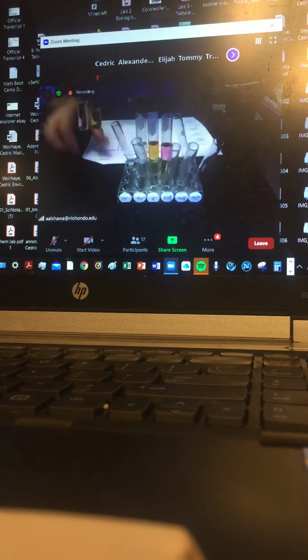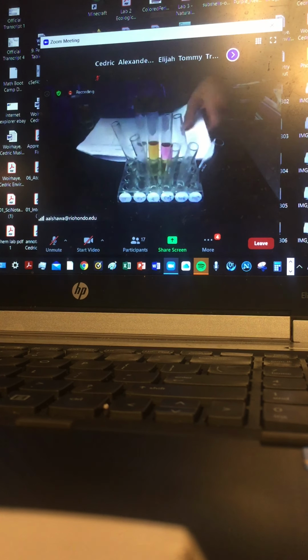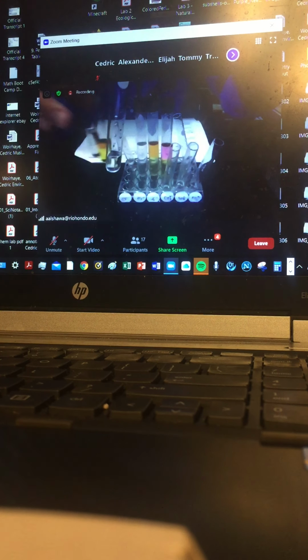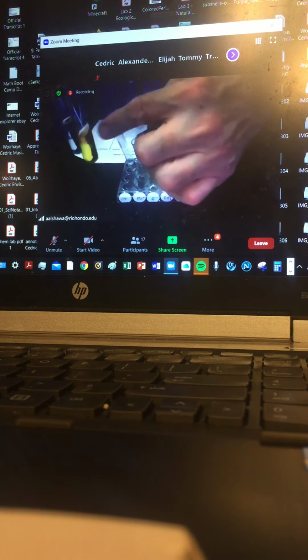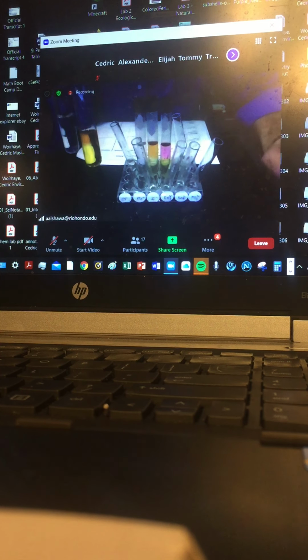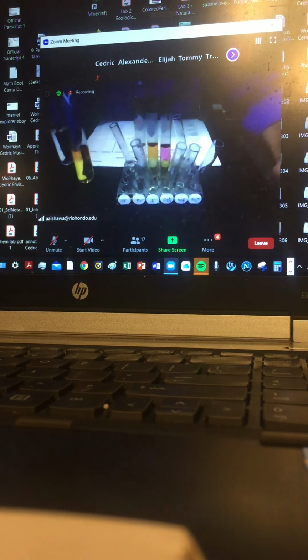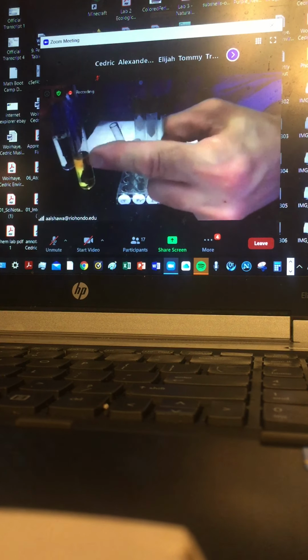So somehow the hexane layer, the top layer. Okay, so in this part, the hexane layer exposed the bromine. Remember, when I added chlorine water to the bromide, it has that look first. Upon addition of the hexane, there's sort of an orangey bromine forming and migrating into the hexane top layer. So I identified that color as bromine, Br2.